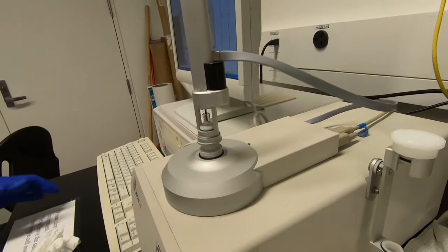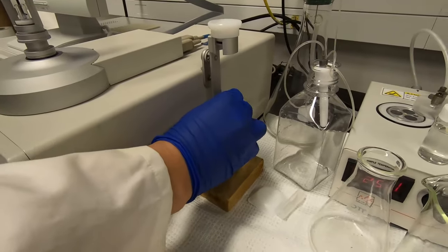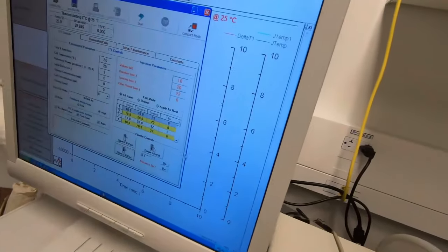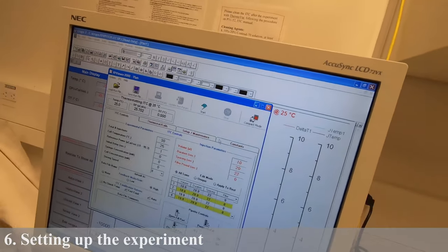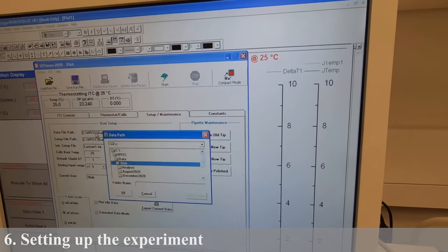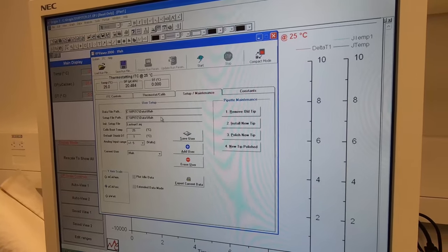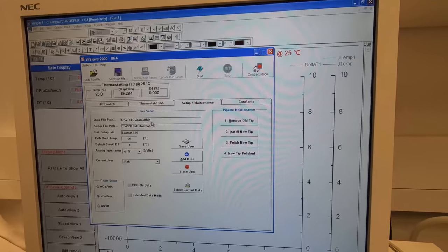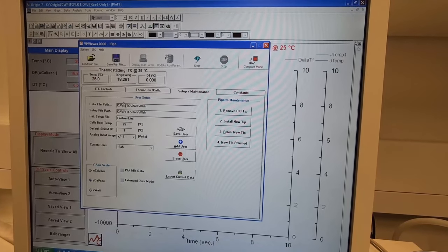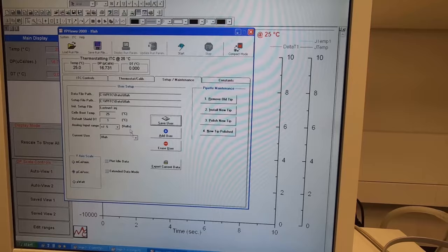Now it's at the bottom — that's the working position for the injector syringe. Leave everything here. The other solution — sometimes this is your ligand or another sample — pour it into the waste. Then go to the control panel. The first step is to set up where you want to save your data. This is the data file path. After you change the data file path, change the setup file path and save to your own folder. Make sure it's the correct path; otherwise you won't be able to find your data.